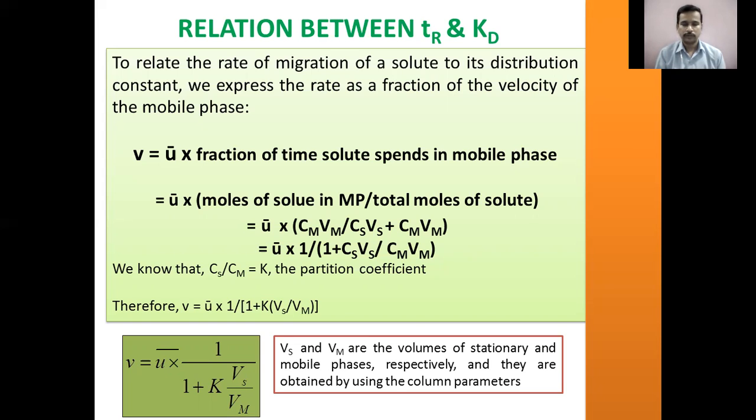So you have understood from this, roughly we can say all those solutes which are not retained by the column or by the stationary phase will be eluted very rapidly and will move almost along with the mobile phase, without any difference in their velocity when compared to the mobile phase velocity. Therefore, the relationship between the time taken by the solute to get eluted out of the chromatographic column and their equilibrium relationship when they are involved in the separation process is very important to understand.